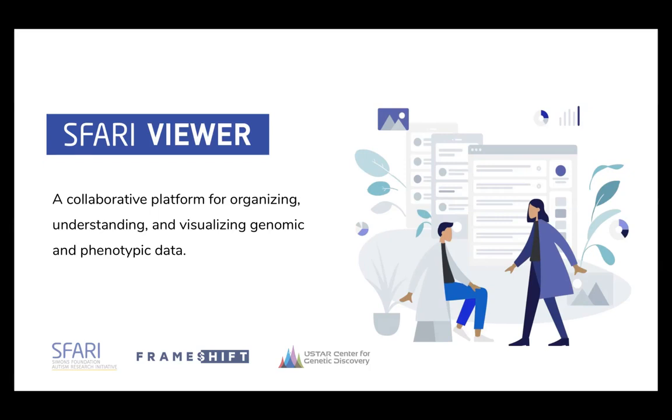Thank you very much for the introduction, and thank you very much to the SFARI team for giving us the opportunity here to spend a little bit of time explaining this new tool that we've released in collaboration with Frameshift and SFARI. This is called SFARI Viewer.